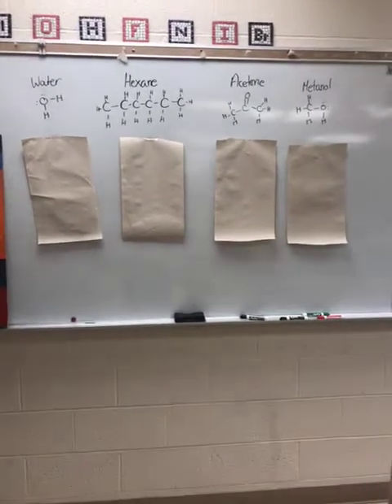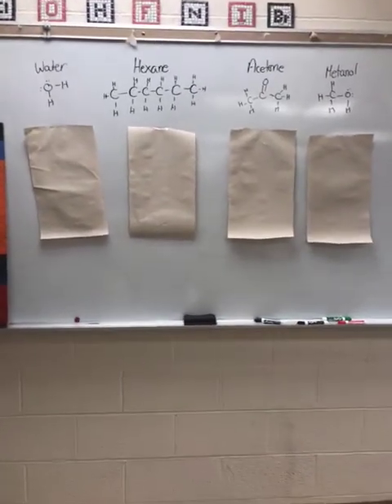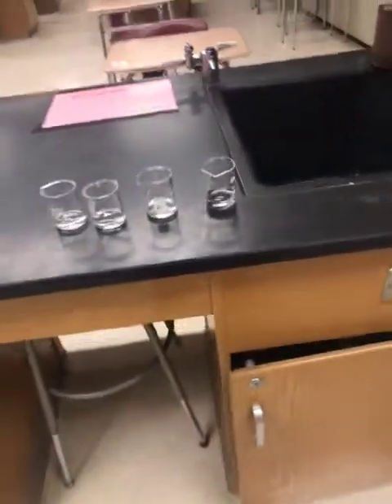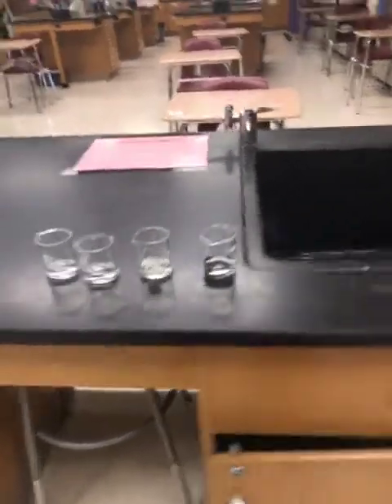Today we're going to compare these four molecules and look at their rates of evaporation. So we have water, we have hexane, we have acetone, and we have methanol. And I have four beakers right here that contain about 10 milliliters of each of these substances.